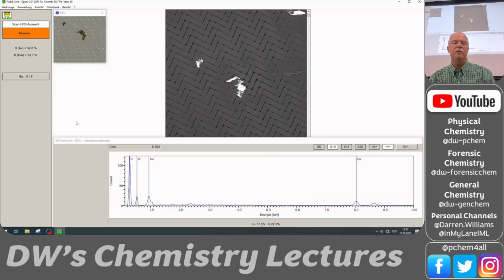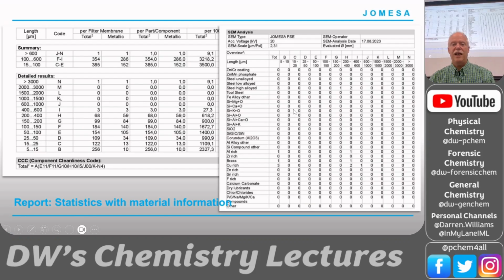What if you saw silicon, and again, carbon and nitrogen might be a little iffy, but still, you saw silicon, it's probably a silicon carbide, okay? Or titanium nitride and so on. So here's the different SEM analysis. You could see zinc chromium, zinc manganese, steel, different types of steel, silicon particles. Here's silicon nitride, here's aluminum oxide. There's different sort of classifications of aluminum rich, zinc rich, and so on.